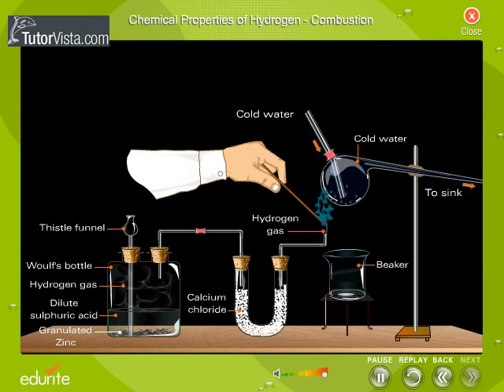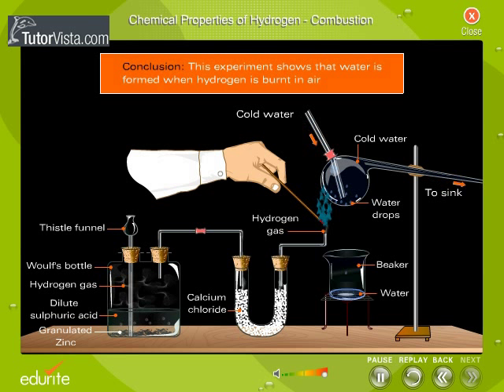You will find that some water droplets collect on the outer surface of the flask. This experiment shows that water is formed when hydrogen is burnt in air.